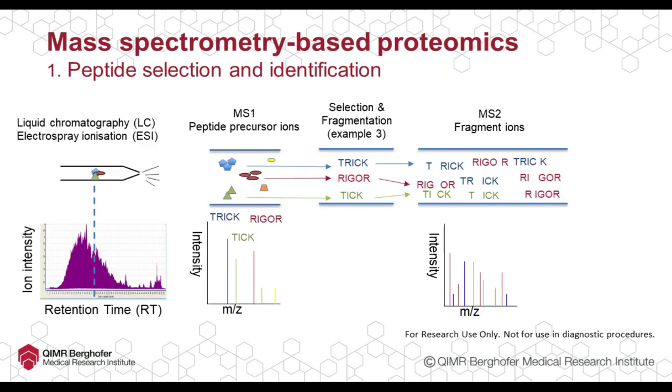Now, let's say we're happy with our protein identification method. Next we really want to get the quantitation of different proteins. But first, before the quantitation, I would like to cover the peptide selection and identification part, because this is an important consideration. So how are the different peptides selected and identified? Usually in bottom-up proteomics, liquid chromatography is used to separate the different peptides, so that there's opportunity for different peptides all to be identified.